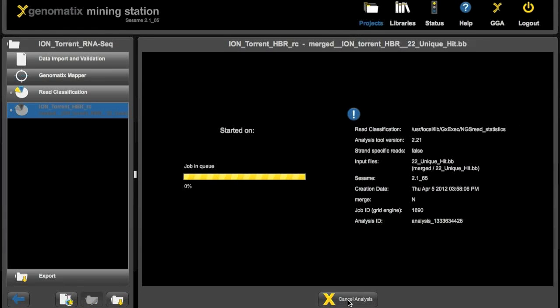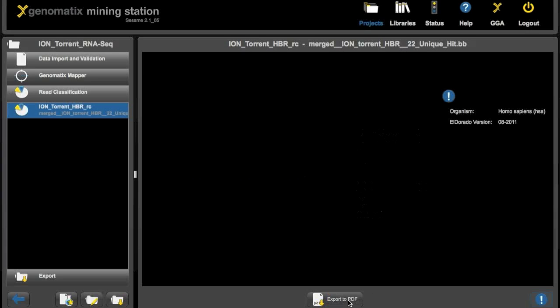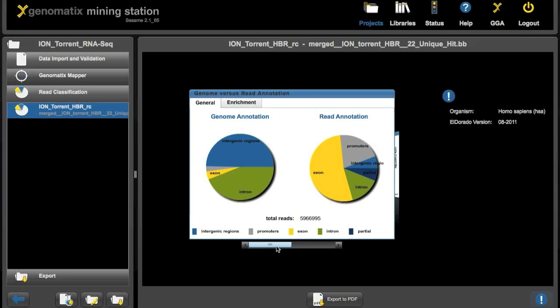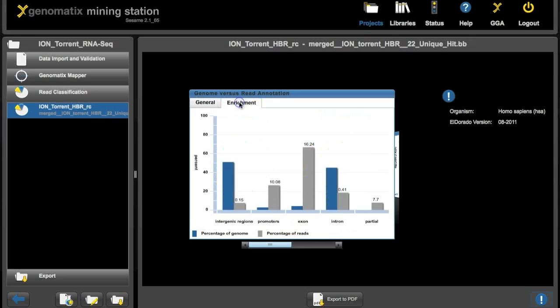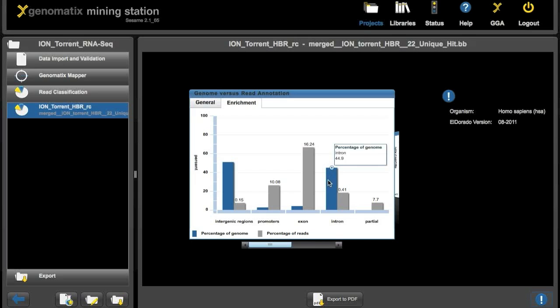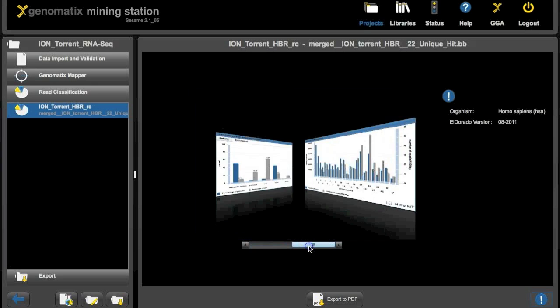And after a little while the analysis is done. So here is the result. As you can see from this comparison, compared to the genome, the annotation for our reads is mostly exonic, as is to be expected from an RNA-seq experiment. You can also see this clearly from the enrichment histogram, where we have a 16-fold enrichment of reads in exonic regions of the genome.